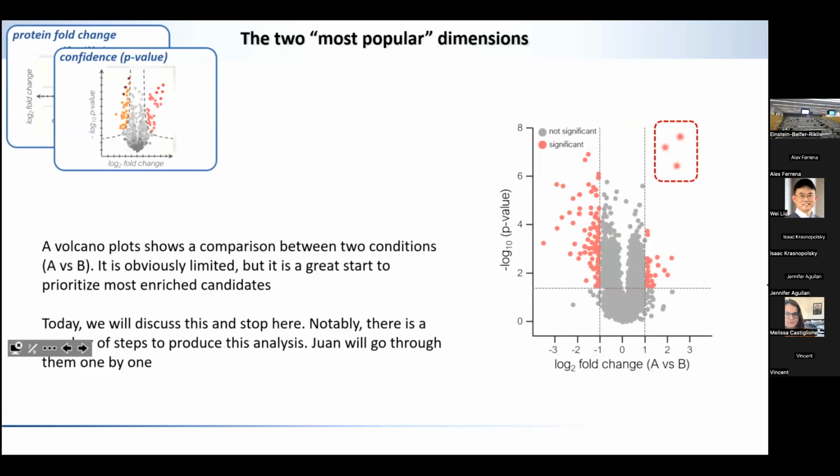The only thing I want to say about this slide, just a little piece of advice, always treat p-values as detectives and not judges, right? Because that's a common mistake that we make when we think about p-value threshold. We think that everything that is lower than 0.05 is good, and everything that is 0.06 and higher should be trashed.